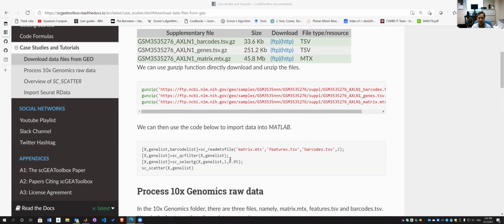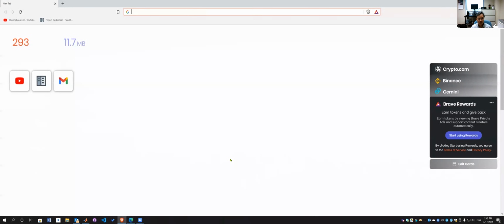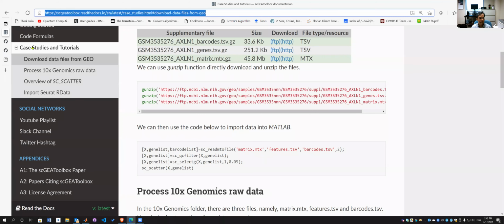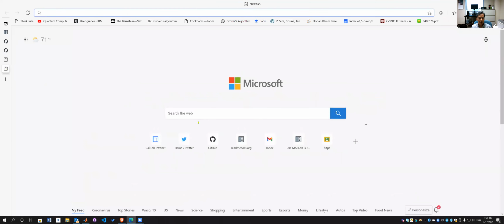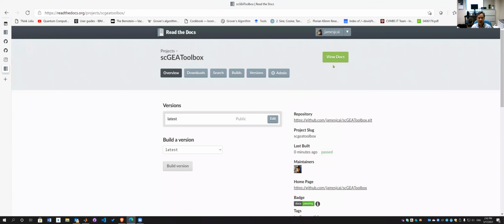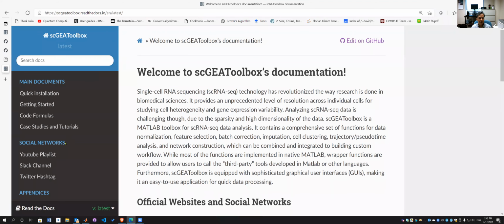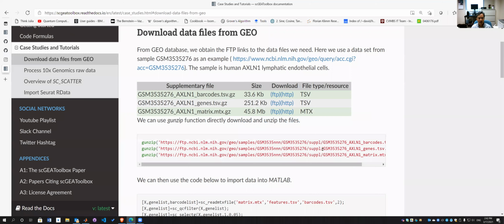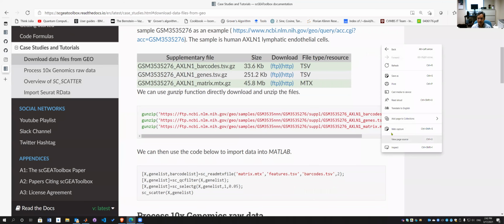It will take some time to allow the system to refresh. Still not yet. What I'm doing here is we just wait until my documentation becomes correct. Download, still not yet.